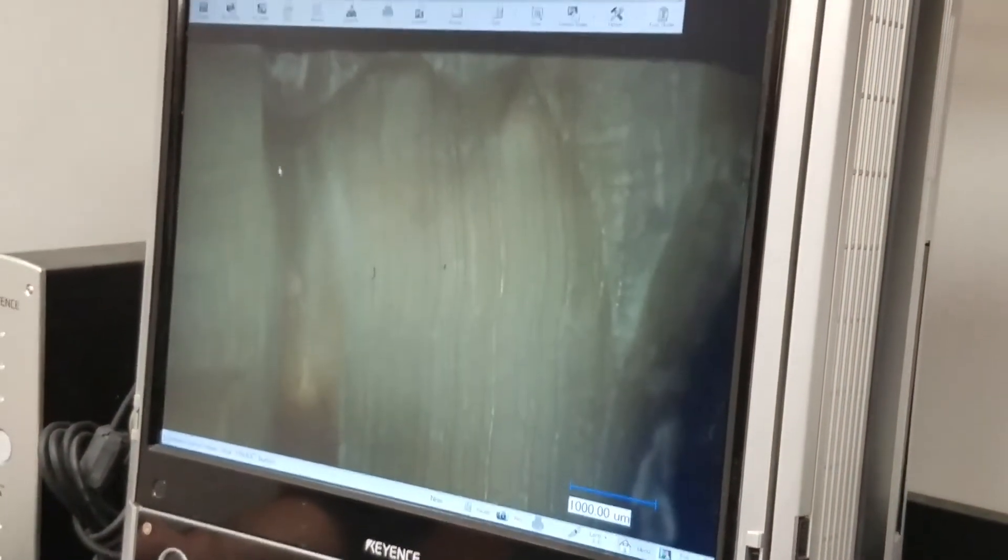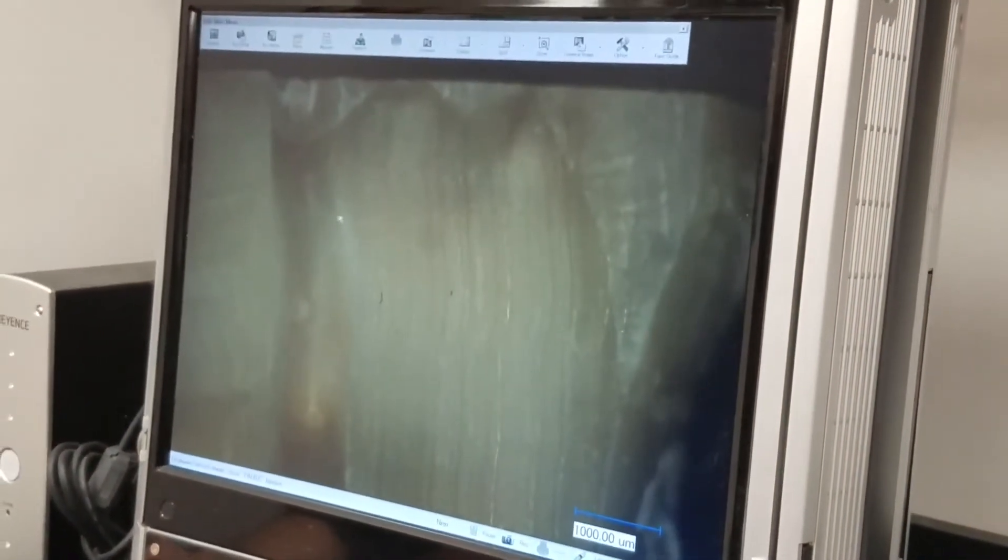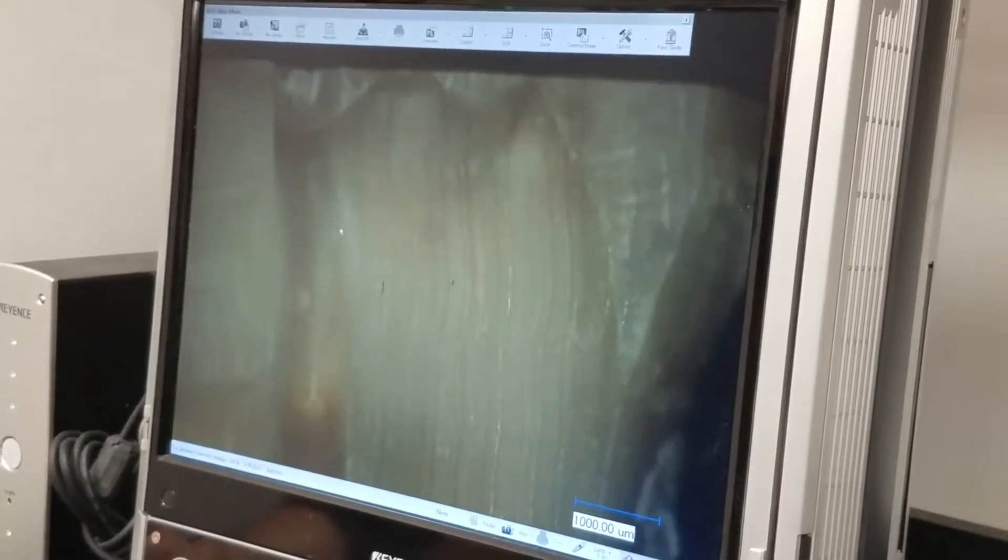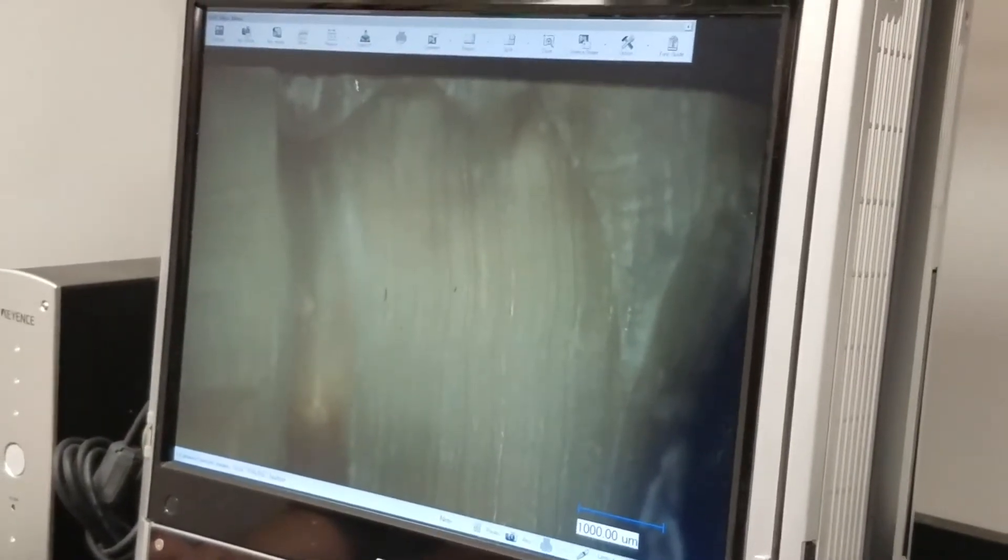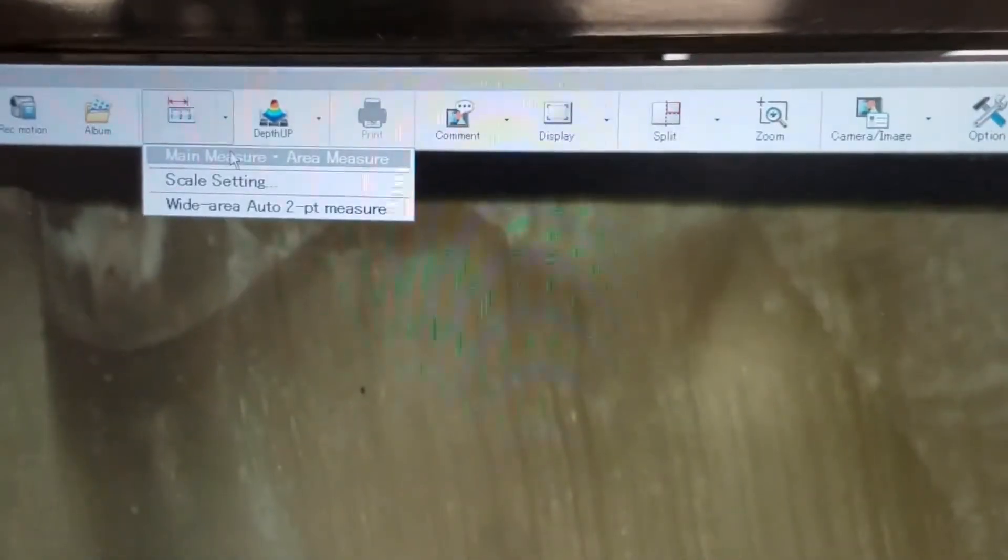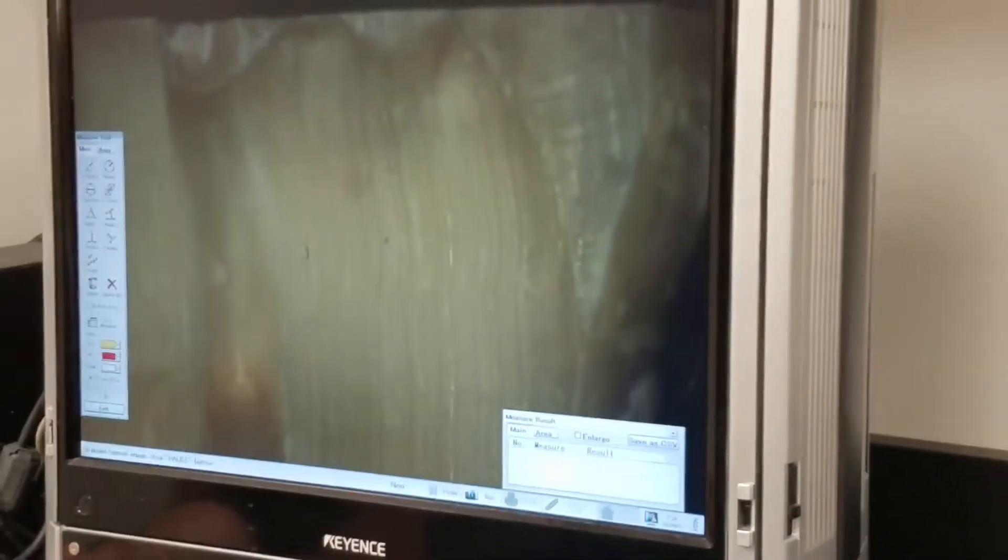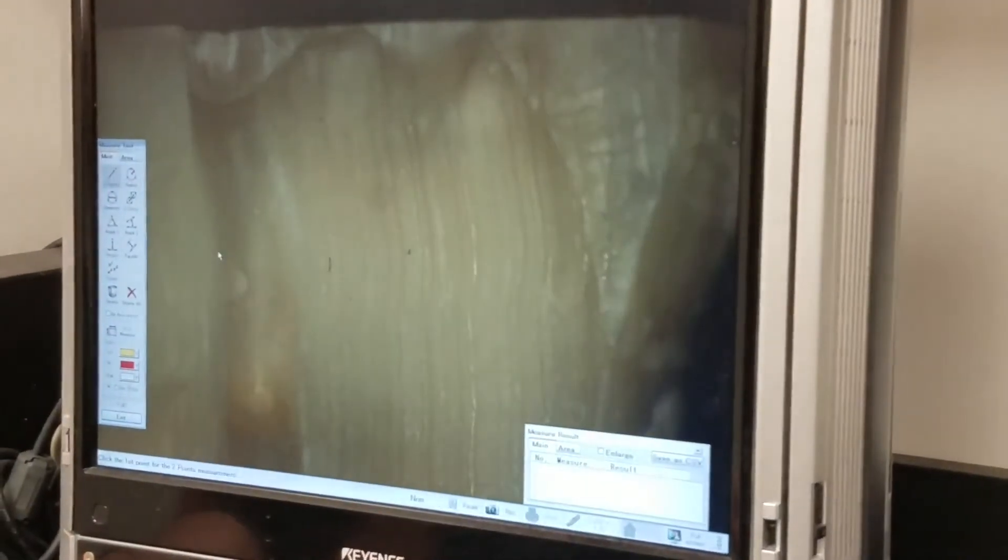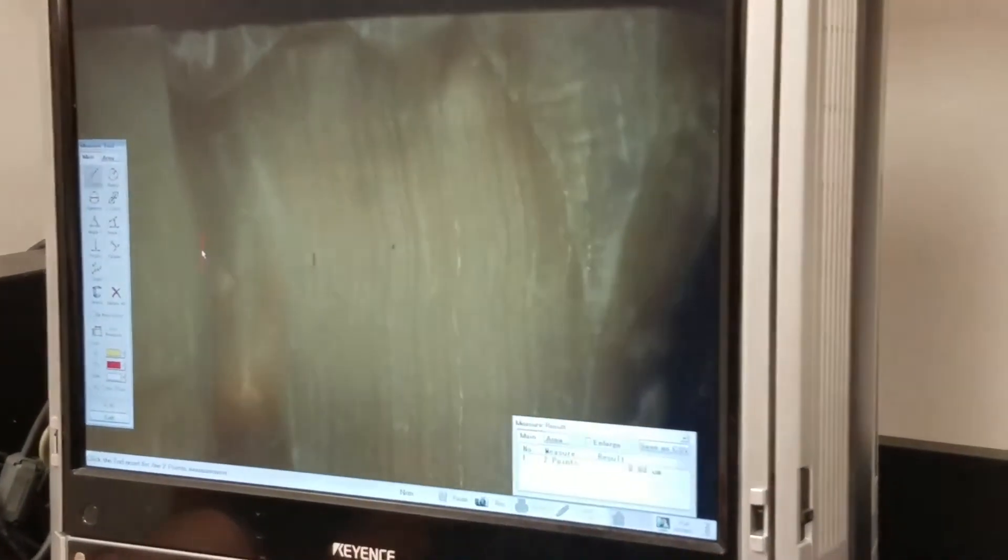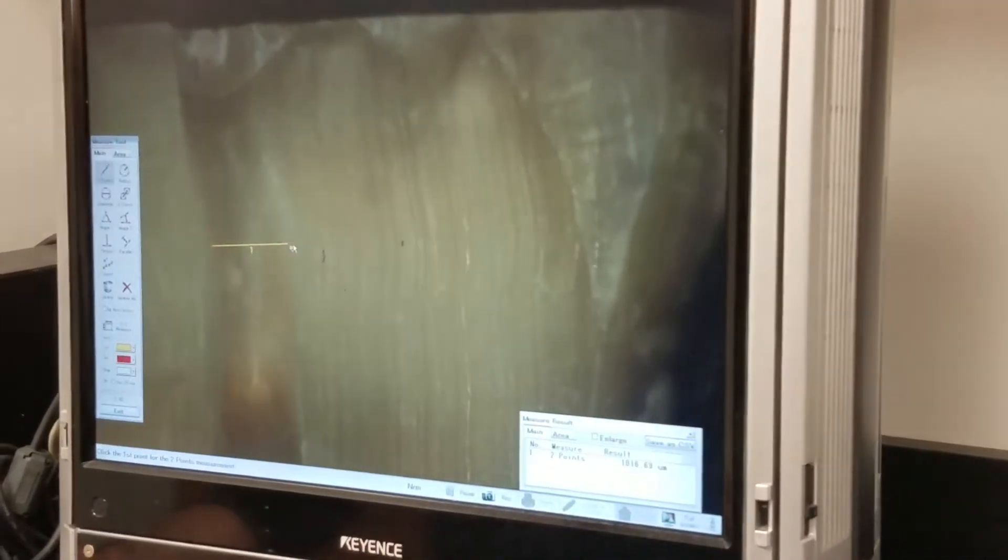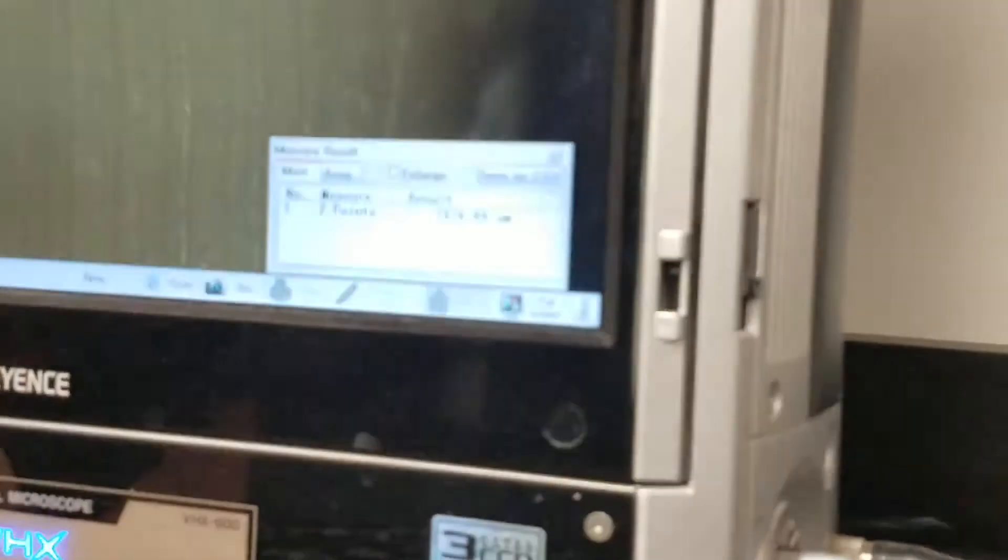And if I want to make a measurement, like if I want to measure how big this tube, this cut is here, I can go to measure, main measure. And if I want to make this measurement, I can go to two points. I can click here, I can click here. And you'll see down here, it'll tell me how long that line is.